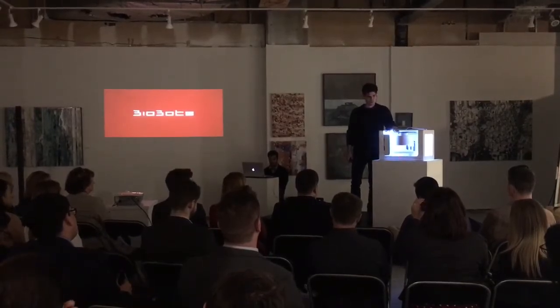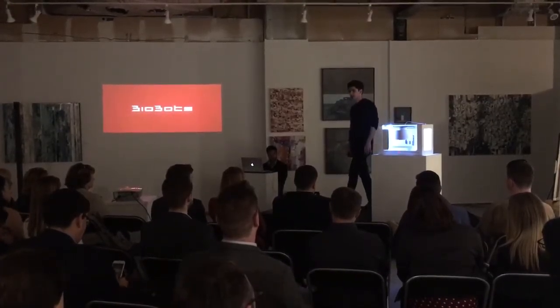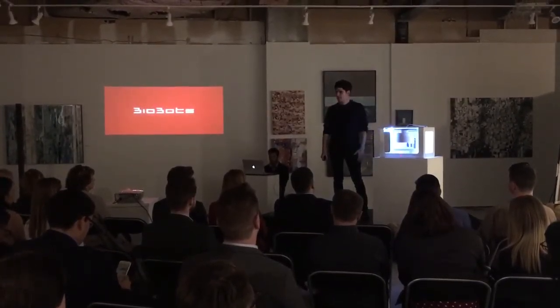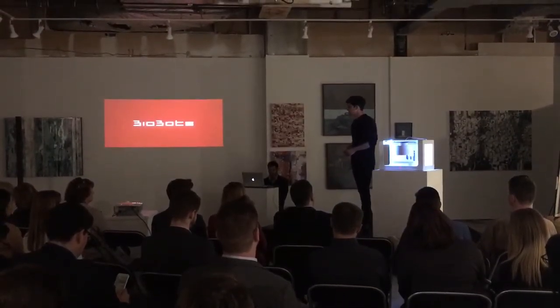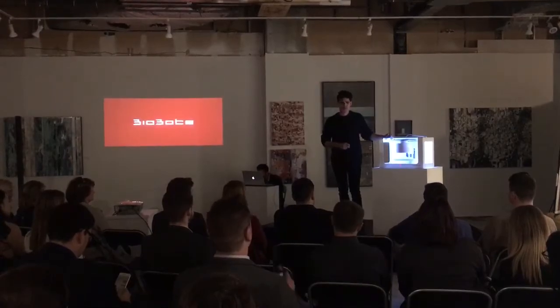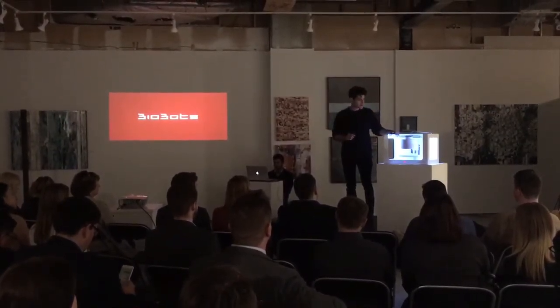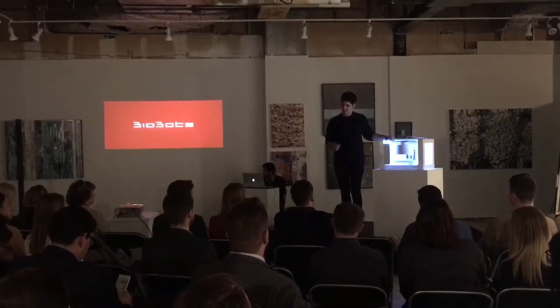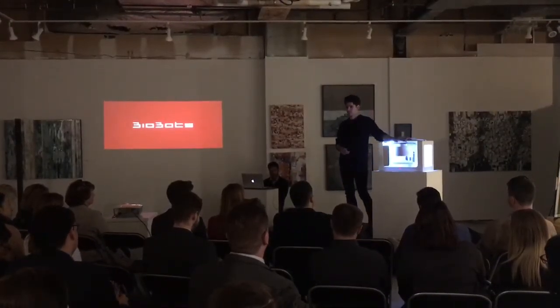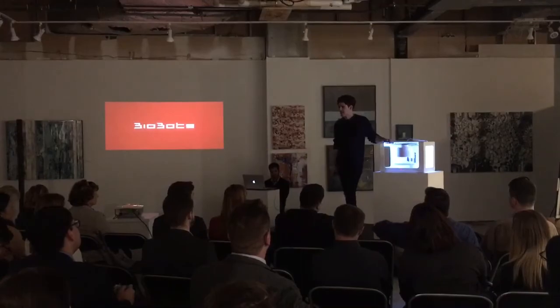I want to highlight a few features here. The first is the 3-axis system on this device. We took the 3-axis system on the BioBot 1 — which for those of you who have it, you know is actually one of the best out there — and we made it even better. We added extra motors for more precise control, and we made every single one of these motors intelligent: they each have their own chips and processors that guarantee precision and ensure the motors won't skip. Beyond that, they actually help track the position so you know precisely where the extruder is at any given time. We're seeing under 1 micron precision on this device under experimental conditions, which is well beyond anything we've ever seen before.